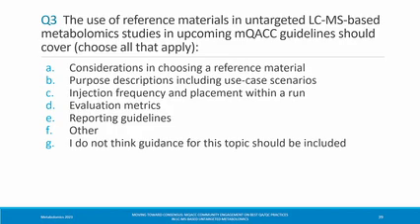So I can't say how we use them necessarily, but it's very important to me to see how you folks are all using it in the community, and especially these use case scenarios really help solidify how those QCs and reference materials actually make a difference, especially because we all know run times can get long, and including too many QCs can be confusing sometimes.